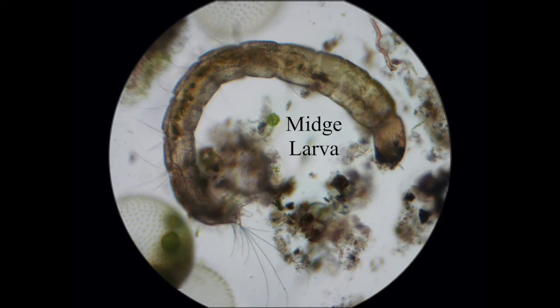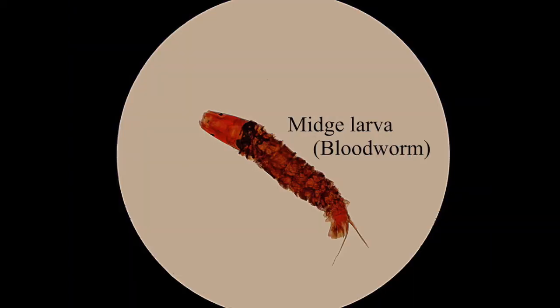This is a midge larva, so this will obviously turn into a typical midge that bites you on a summer evening. This is another type of midge larva — quite a lot of midge larvae that you find are red looking like this, and they're quite often just called bloodworms. Sometimes you can buy these in pet shops in large numbers to feed to fish.